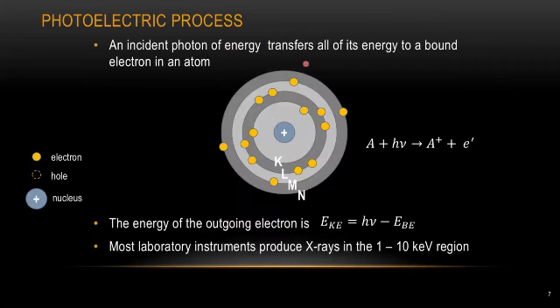So as I mentioned earlier, the main principle behind the XPS measurement is the photoelectric process. So we're going to spend a couple of minutes to learn what the photoelectric process is. Here we're going to use a simple atomic model to describe this process. In the atomic model, the electron is circulating around the nucleus, and each orbital we label with X-ray notation, with the inner shell called the K shell, L shell, and so on. During the photoelectric process, we shine an incident photon on the atom. For XPS, we use a mono-energetic X-ray, and it knocks out one of the electrons from the atom.